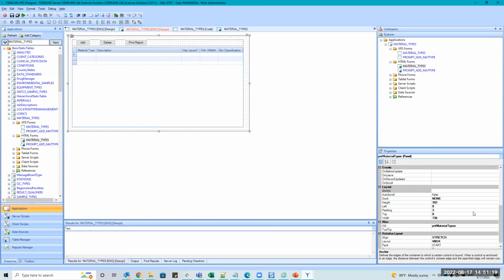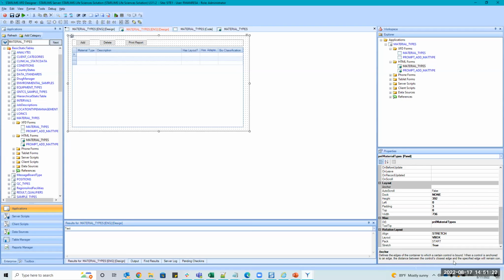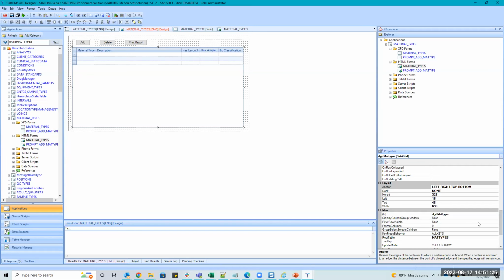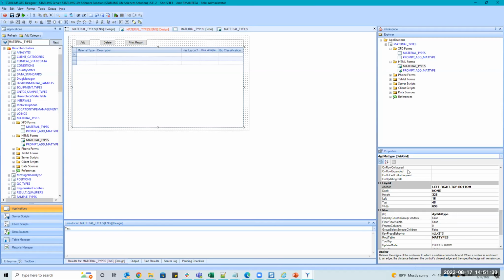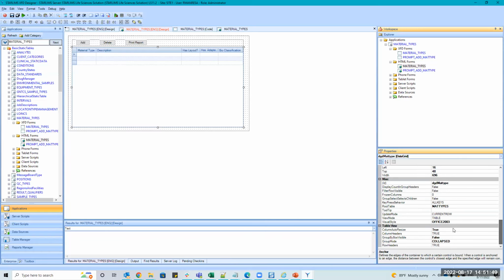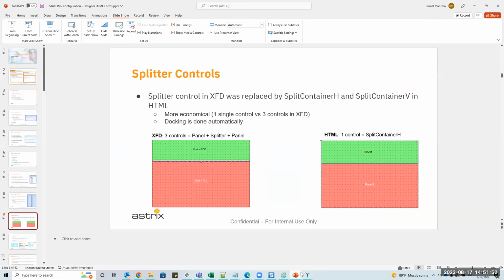What's more recommended is relative layouts down here. The same way we used to anchor, you would now do relative layouts. So there's a mapping between anchoring back in the days, which used to do it like this, where it's basically saying the left, the right, the top, the bottom needs to be anchored so that when you move, it stretches accordingly. You can actually just get rid of all that and then use these layouts, which we're going to look at in a second. That's what it's stating here, right?